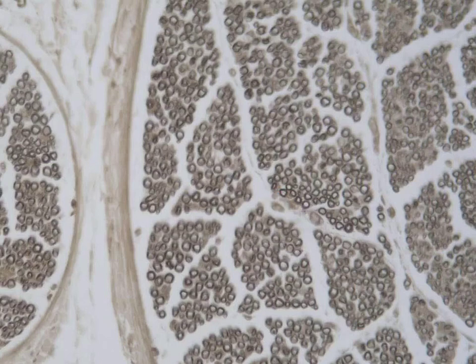So here these circles are not thin, they have a thick wall, because all this area is filled with the myelin sheath, which takes the black color of the osmic acid, being formed of lipid.